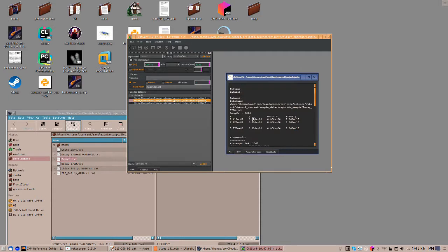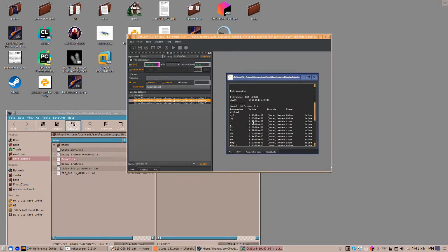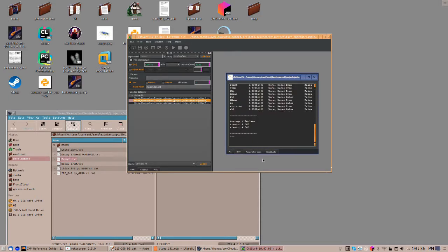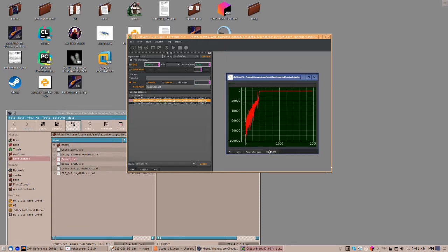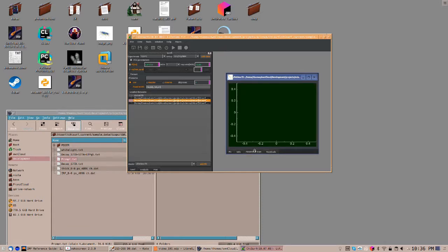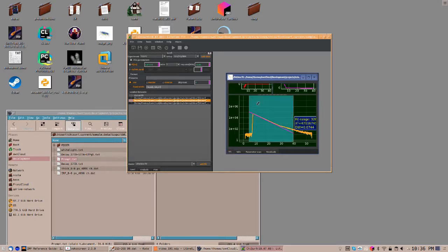On the info, you see a summary of the fit result. On parameter scan, you can scan parameters, meaning you can determine the range where a parameter is possible within the noise of the data. In residuals, you get displayed the residuals.